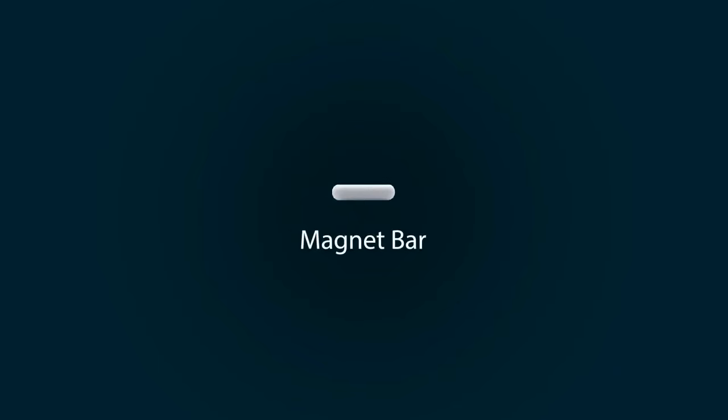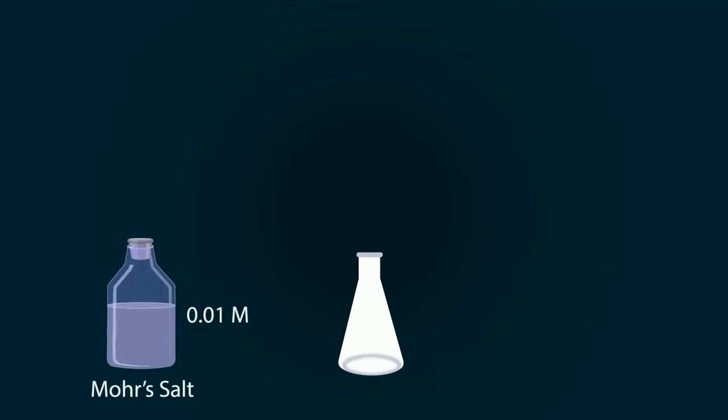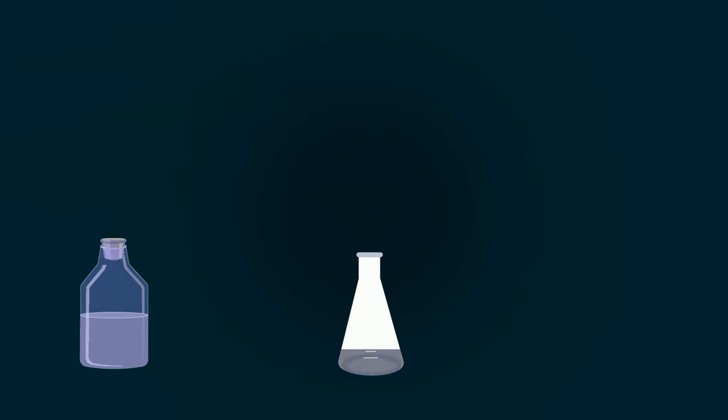First of all, take a conical flask. Now pour 0.01 molar Mohr's salt into it with the help of the pipette. Pipette out 20 milliliters of Mohr's salt and put it into the conical flask.